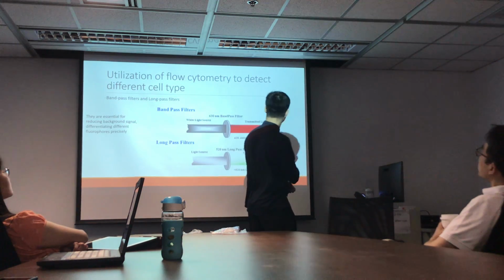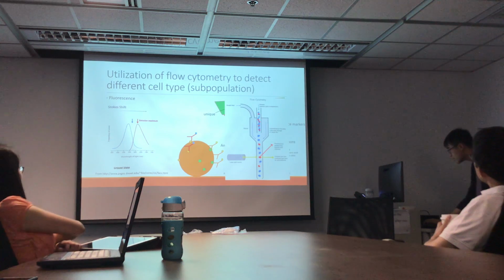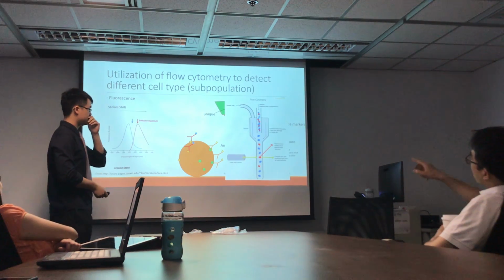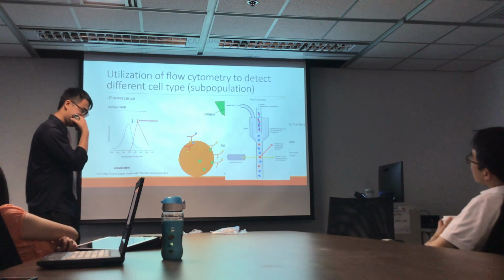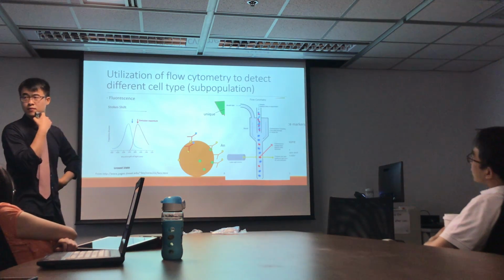I'm curious, how do you do the cell sorting afterwards? Do you have a slide for that? After this, you want to sort labeled and unlabeled cells. Do you just do it manually, or is there an automatic way? Well, there's a charging method. You charge the droplets.